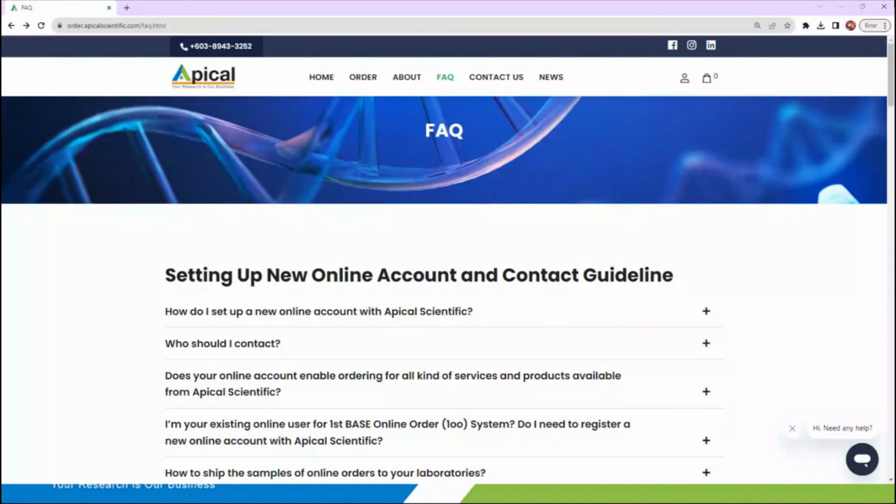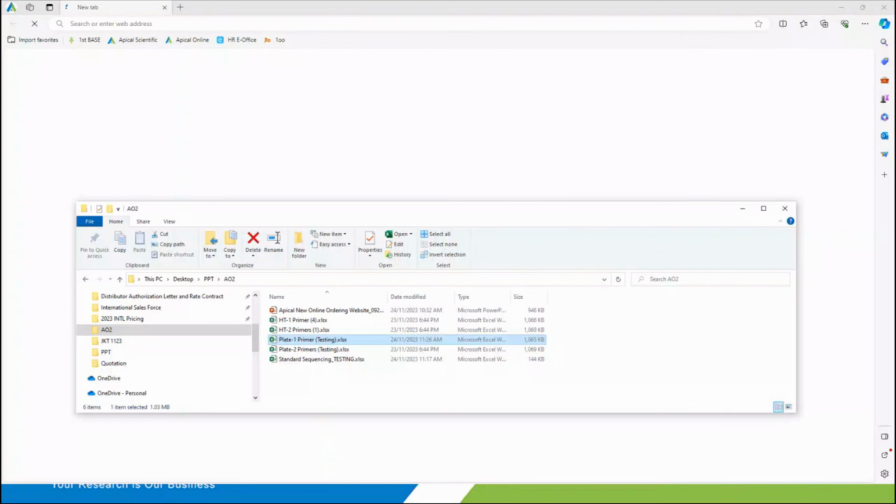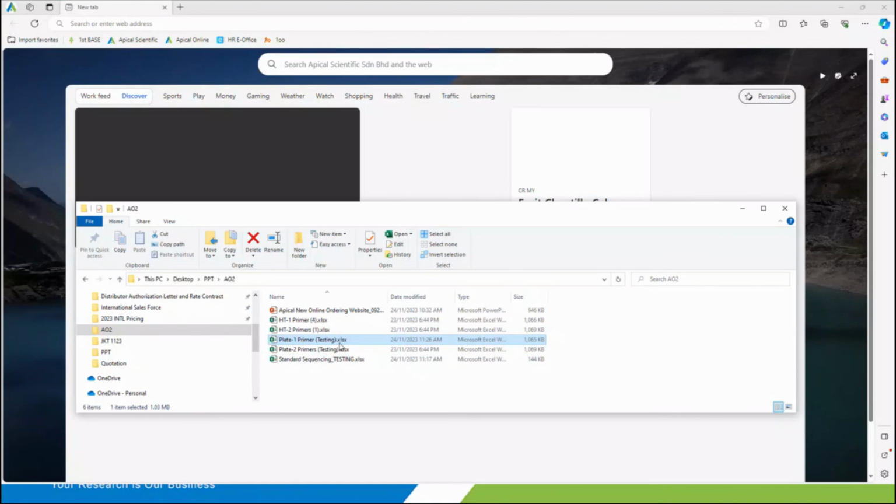All right. Okay. How to tell if they are using a different primer besides those in the universal primer list? I believe in the order form you can state the primer that you want to use differently, and then you can state another. Maybe I can show you some of the information here.